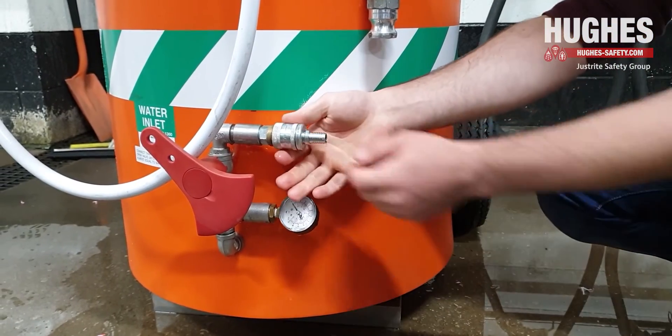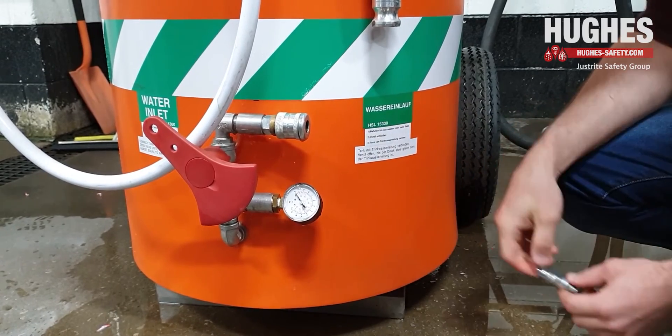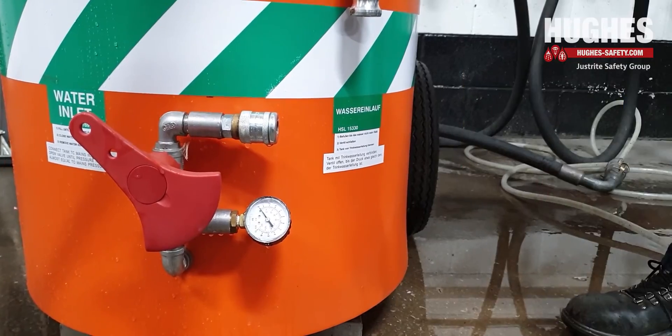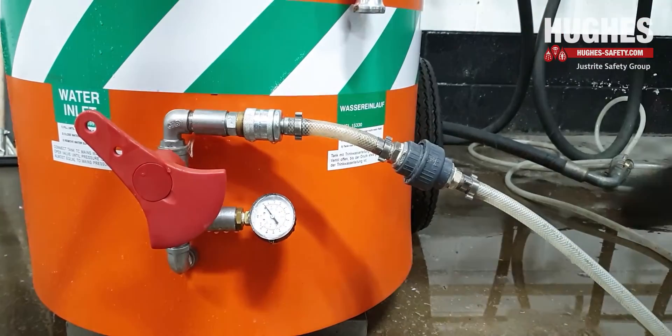To refill the unit, connect the mains water supply hose to the quick release hose adapter that comes attached to the unit, shown here next to our hose. Then connect the hose adapter into the quick release connector on the unit. Turn the mains water supply on.